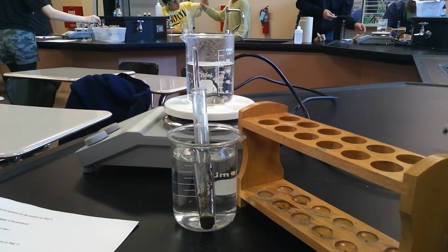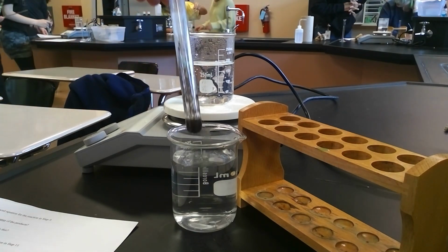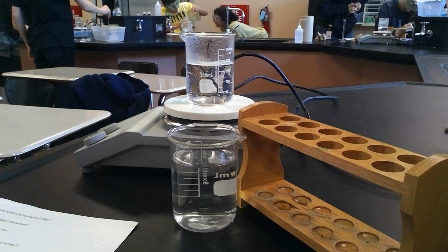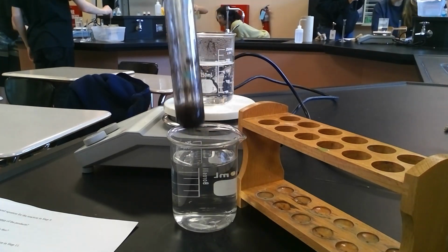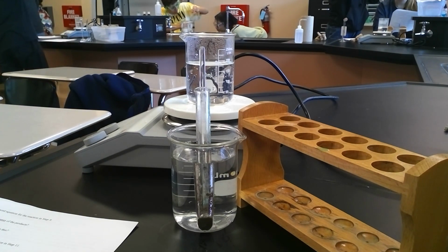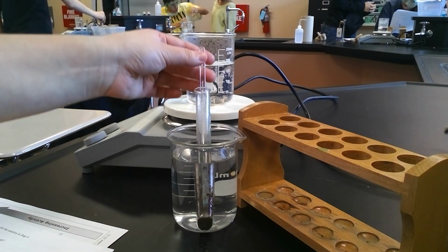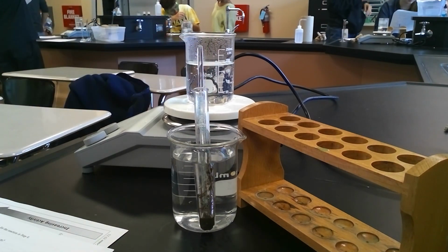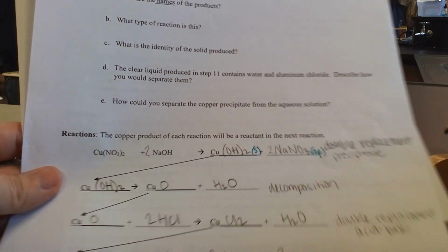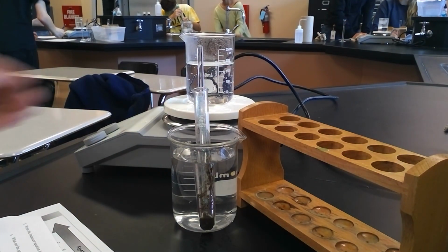So as it sits right now, I don't see any water. So what you're looking out for is knowing that water is a clear solution. If this is just sitting here, I don't see water in that. It just all looks dark. But the longer it sits, maybe I will see some water. So I'm going to let that just sit there, finish cooling off. And the black stuff does look chunky. So we'll see. It looks like the copper 2 oxide is likely a solid. And then we'll just keep on waiting here.